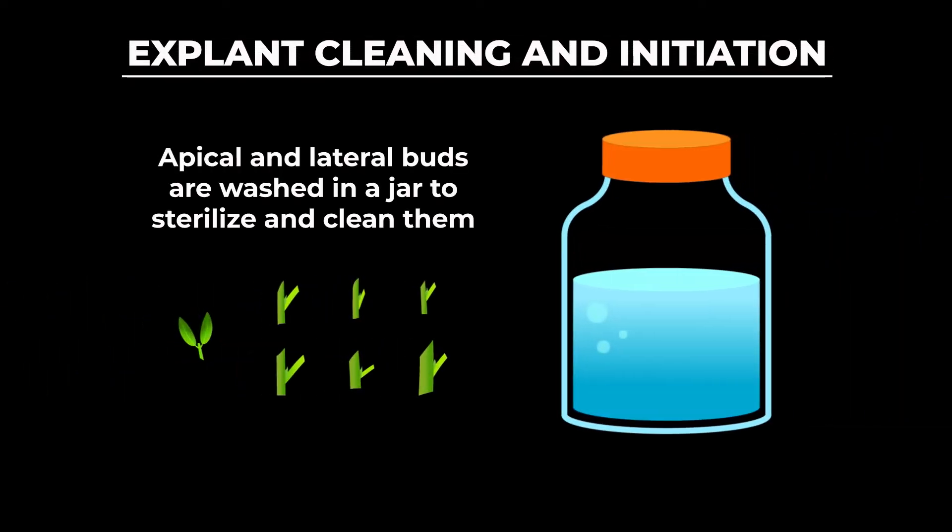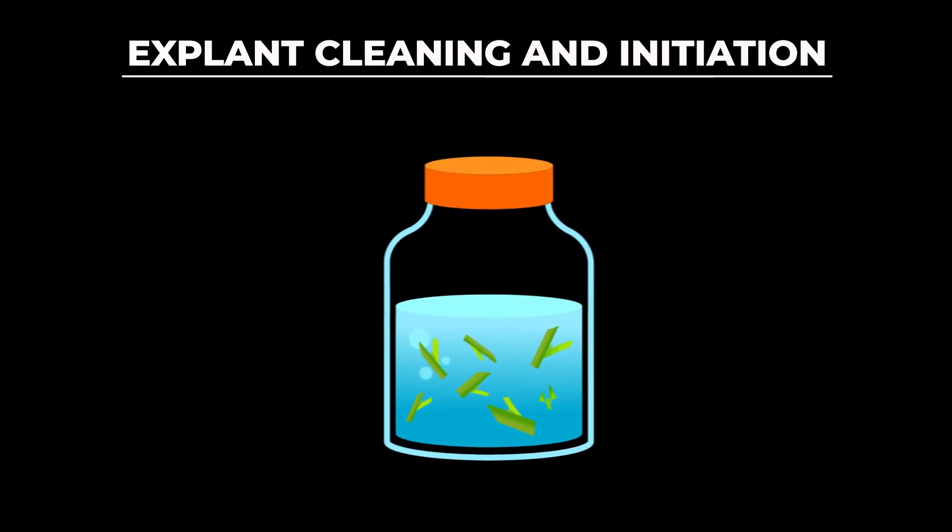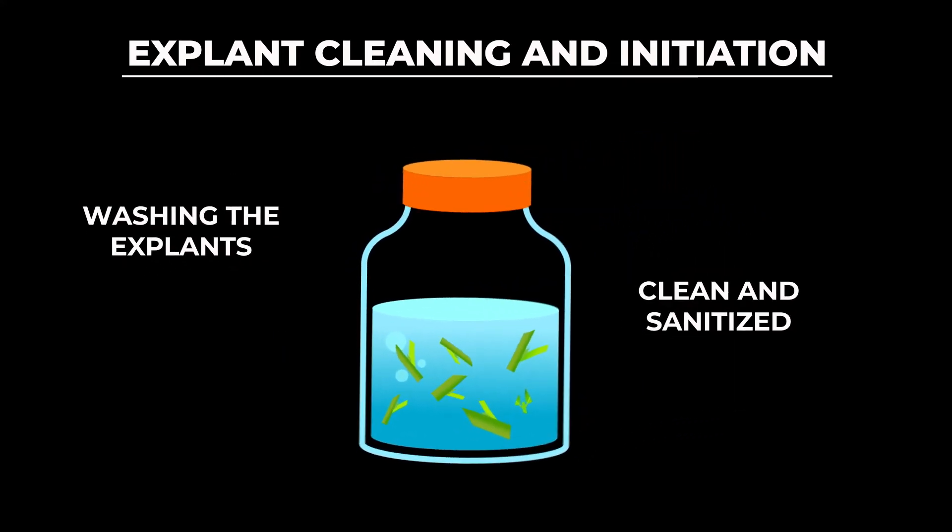To clean our little explants, we're going to place them in a jar with a cleaning solution that will sterilize them. Give the jar a little shake and nice clean explants.